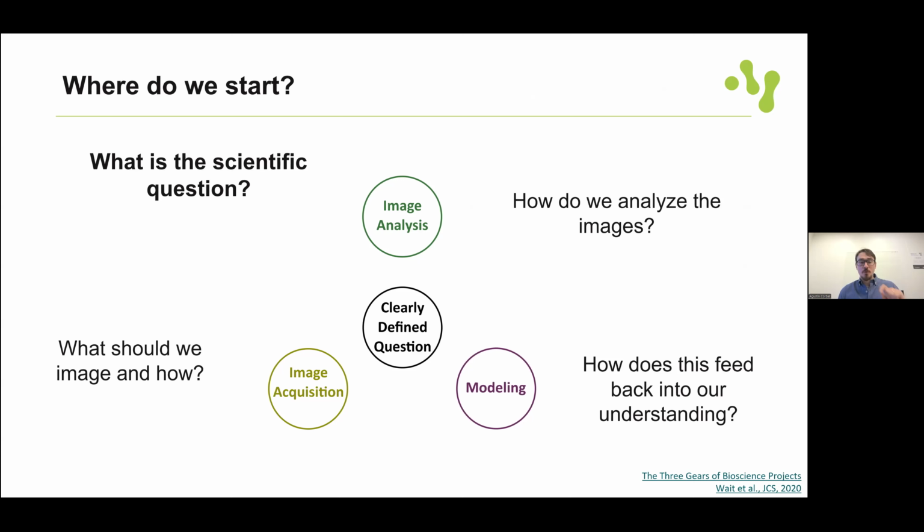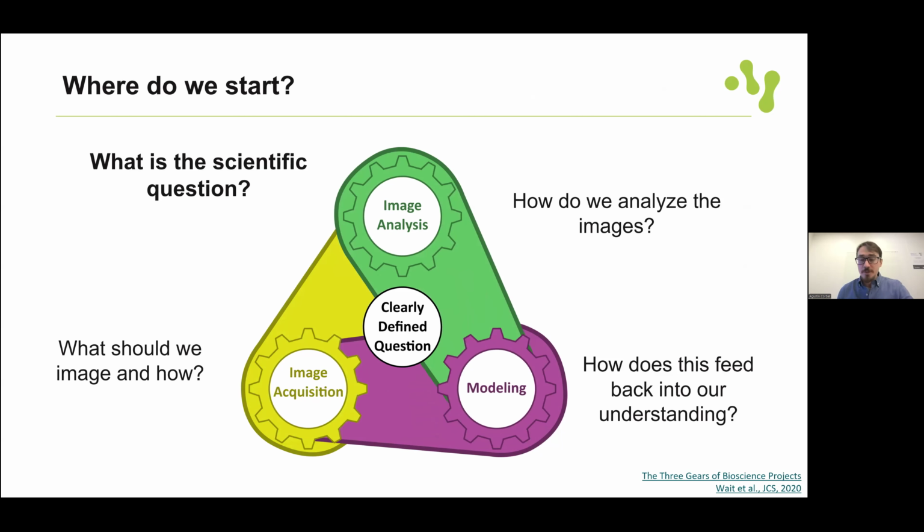Did we think through our image analysis? Do we need to quantify something else? Do we need to improve image acquisition? So all these gears feed back into each other and help design better experiments, which are more informative and answer our hypothesis better.